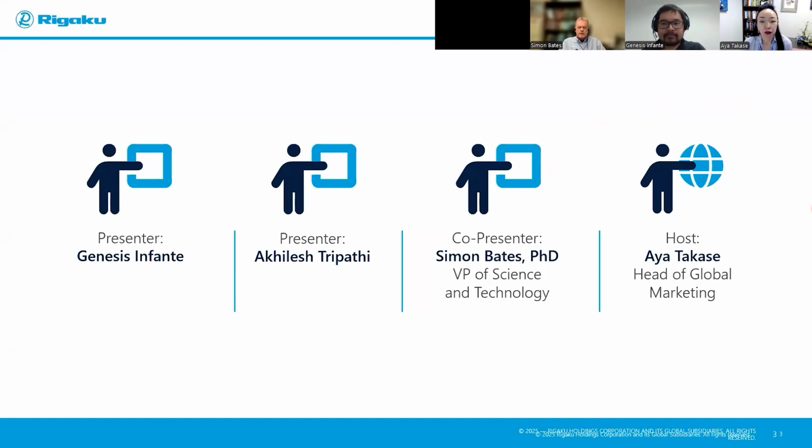Thank you for joining us for our webinar series, Enhancing Pharma Processes with X-ray, Thermal, and Raman Analysis Tools. In this webinar series, we will discuss various practical analytical techniques and their applications to enhance pharmaceutical research and quality control. The episodes are organized by the different stages of research and production. And in this second episode, we will cover analytical techniques related to preclinical development and preformulation.